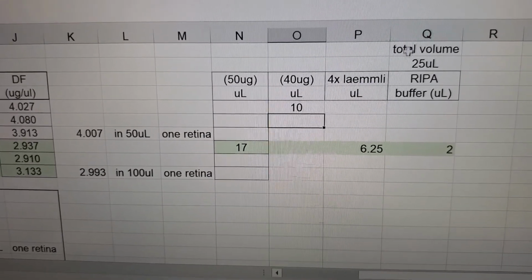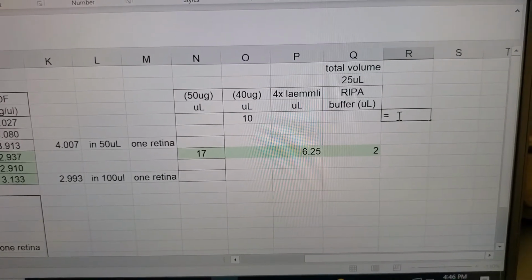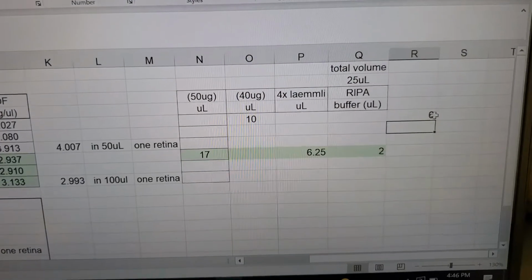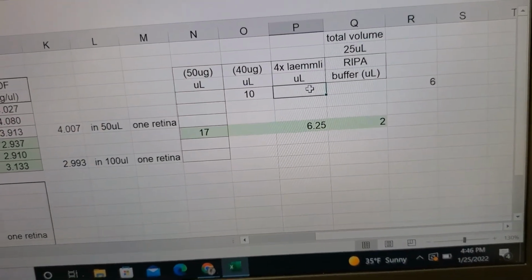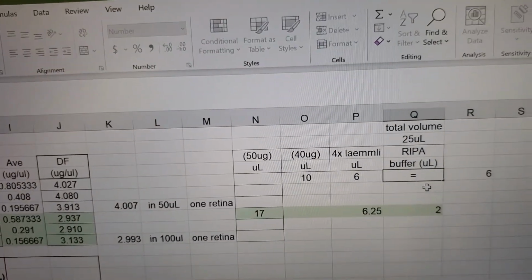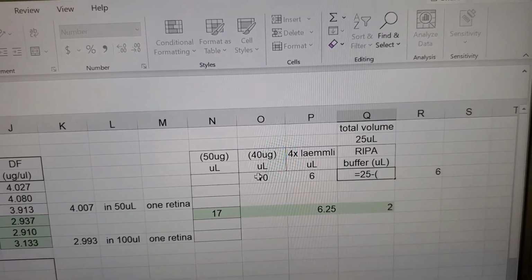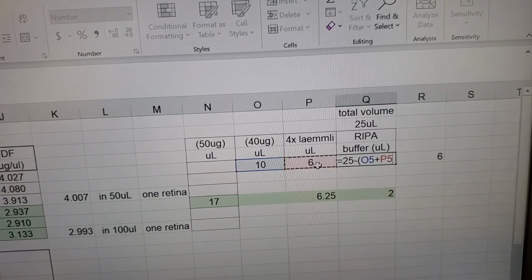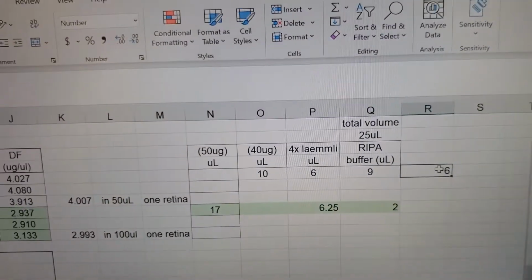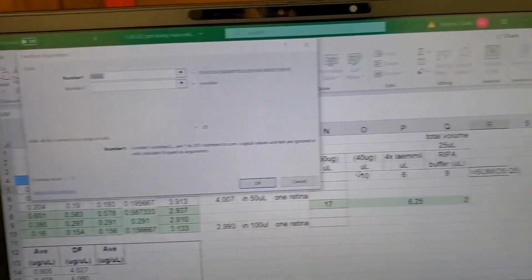So to this, once again, we want 25 microliters. What I like doing with Excel, and I'm using the 4x Laemmli, is that 1/4 of the sample should be 4x Laemmli. So I type 25 microliters divided by 4, and 1/4 of that is 6. To determine what our RIPA buffer is going to be, we put equals 25 minus the summation of our sample plus our 4x Laemmli. This should give us the total amount of RIPA buffer. To verify that, if you're doing this in Excel, put equals sum, and you add those 3 values.